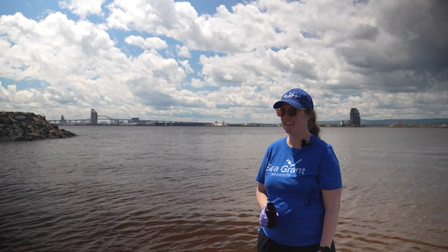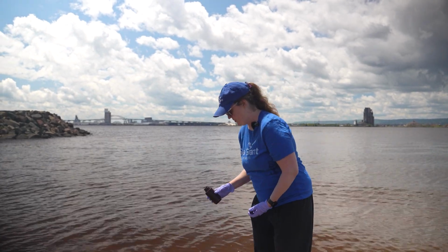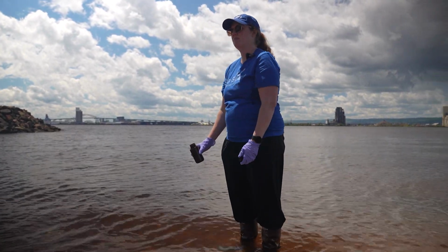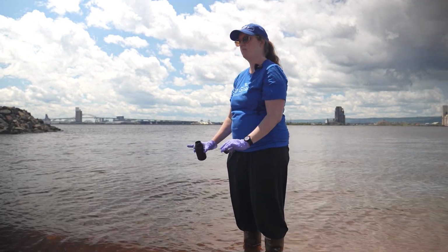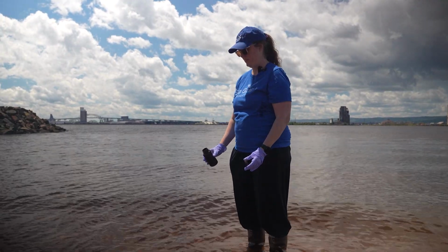All right, so before we sample, we're going to triple rinse the bottle with lake water. And we do this because we just want to remove any debris that may be in that bottle. And so how we're going to do this, you want to be careful not to put your gloves below the surface of the water, because then they're just going to fill up with water and not protect you.